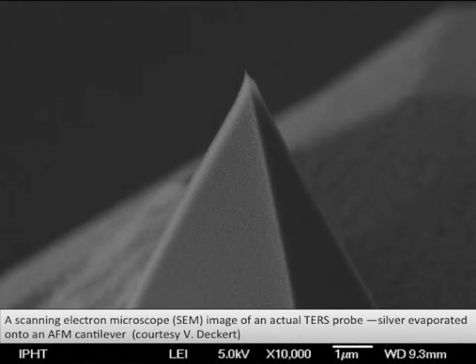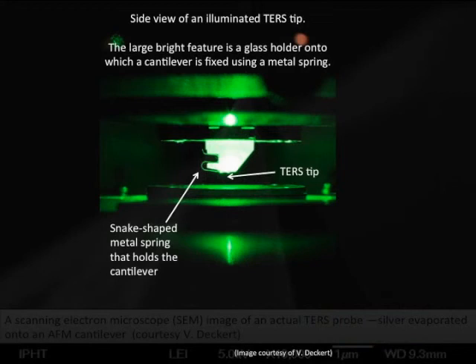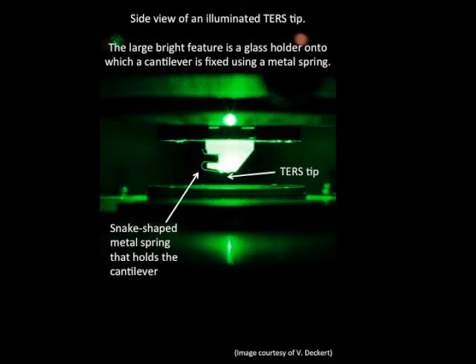In that case, you are not interested in many cases to homogenize the sample. You want to distinguish localities. And this you can only do if you put the enhancing site, in our case the TERS probe, to the different localities. And we can do that with a lateral resolution approaching 1 to 10 nanometers. So that is a big difference if you compare SERS and TERS. SERS is not a method where you can achieve high lateral resolution.